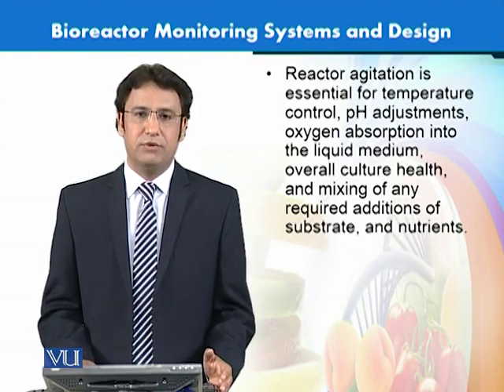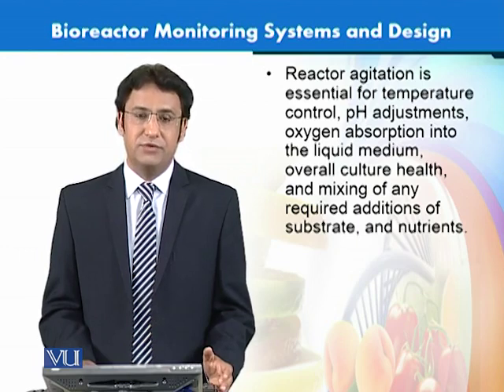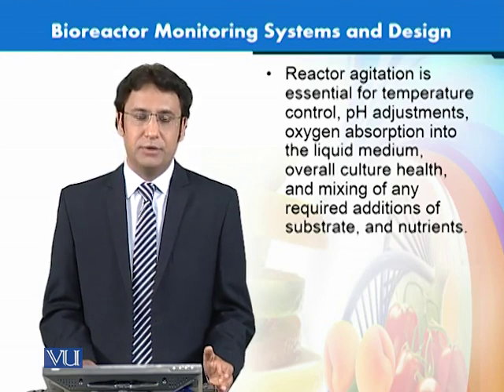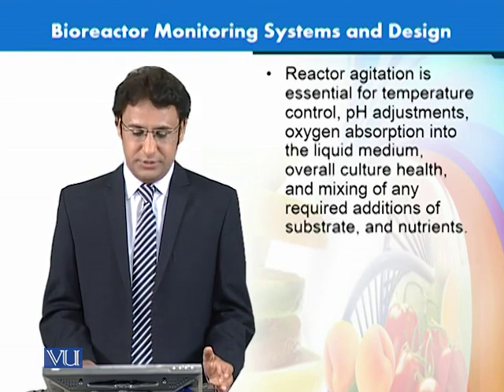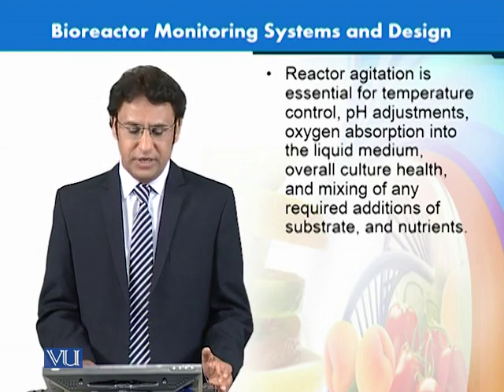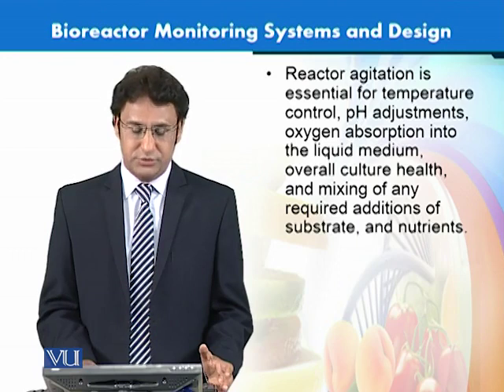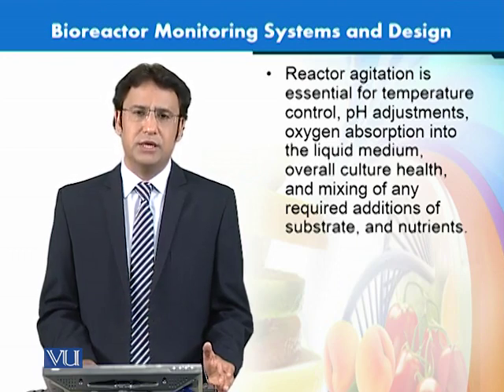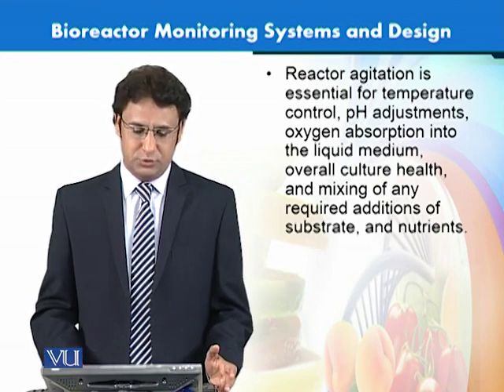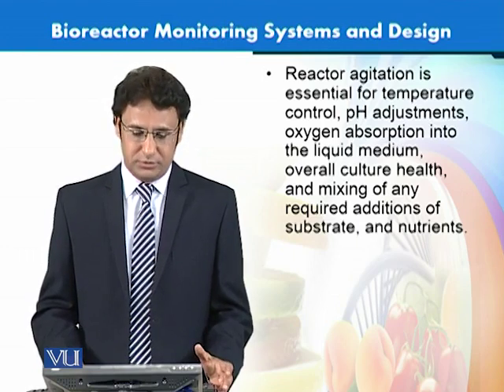If you look at why agitation is required in this reactor, there are many reasons. A constant and consistent agitation helps in temperature control, pH adjustment, also oxygen absorption onto the liquid medium, and overall culture health. We can mix all the ingredients and nutrients together, which is very helpful. So agitation has a very important role to play for the normal growth and development of these fermenting microorganisms.